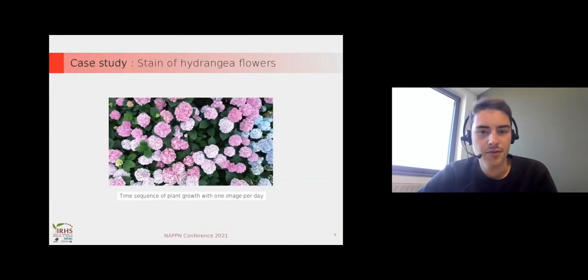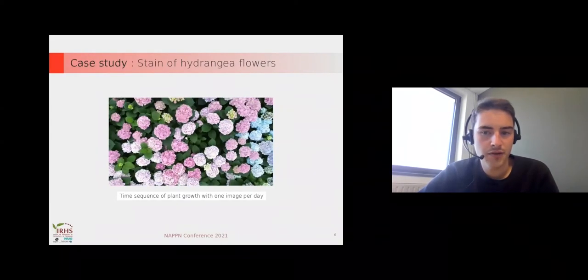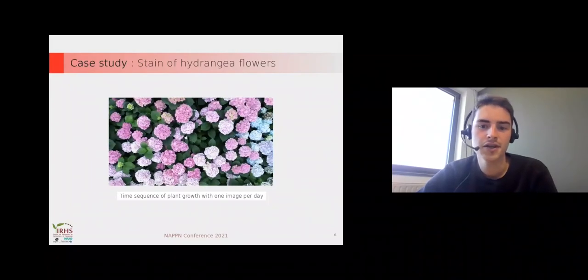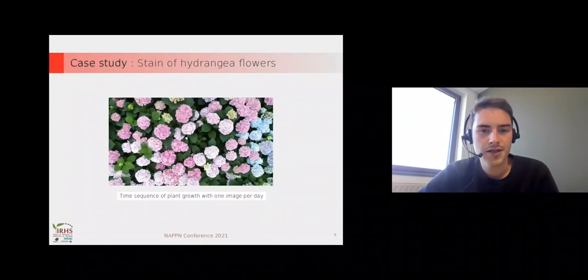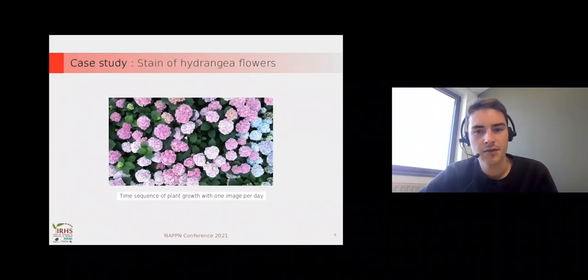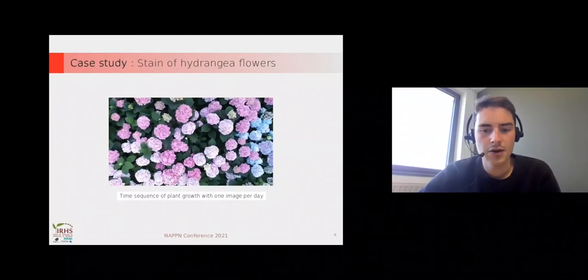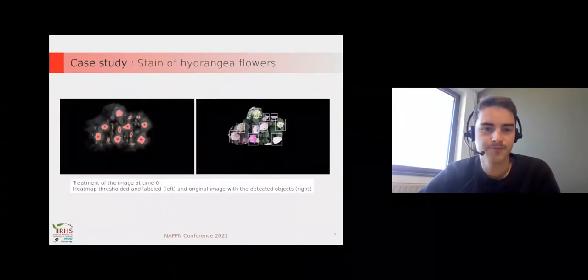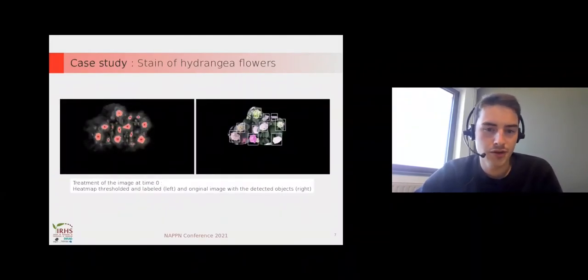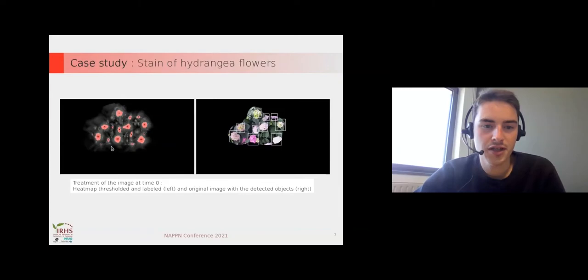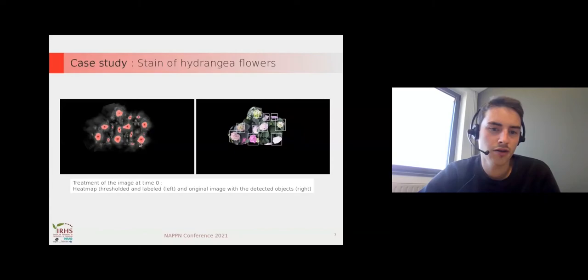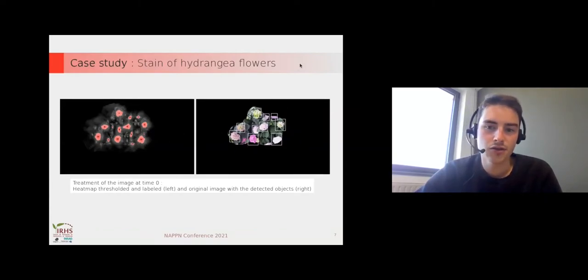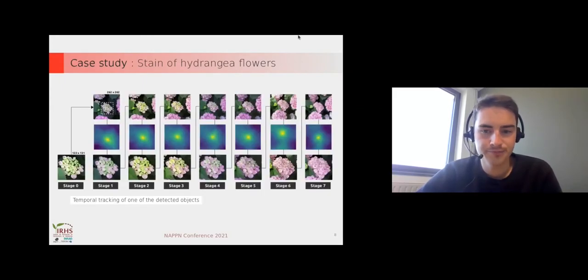Here we have an example with a canopy of hydrangea on top view. We want to analyze the evolution of the staining of hydrangea flowers, and we have one image per day. The first step is to do the template matching, and after some thresholding and morphological processes we have the ROI detected. The ROI is the flowers of hydrangea.